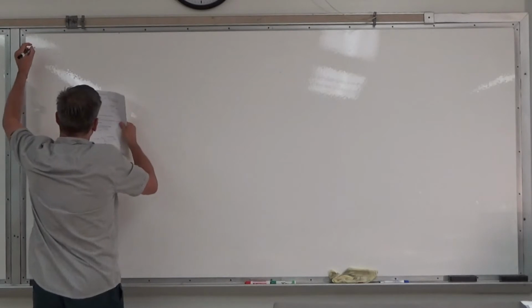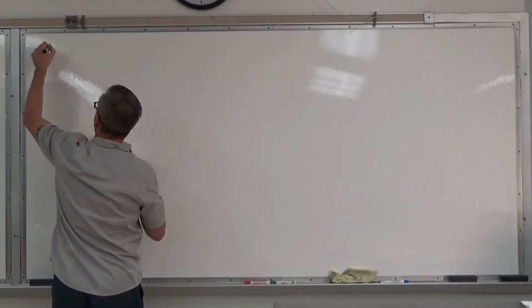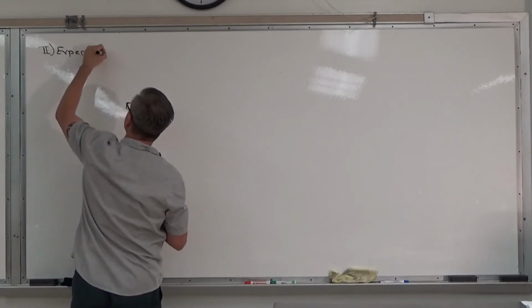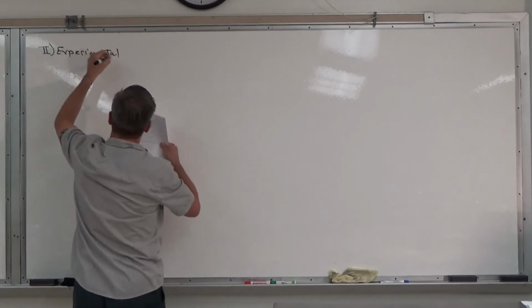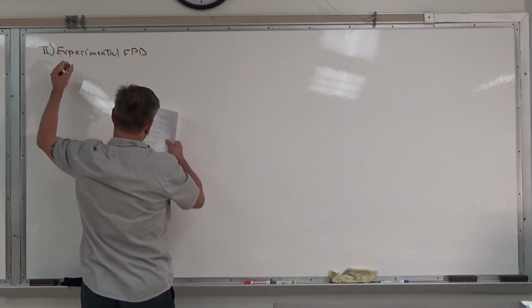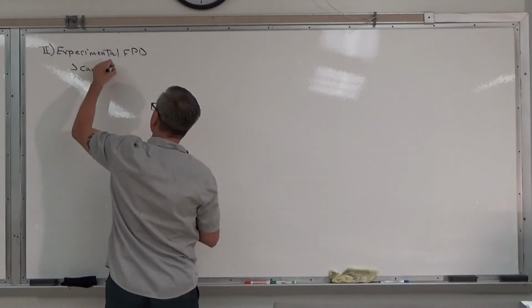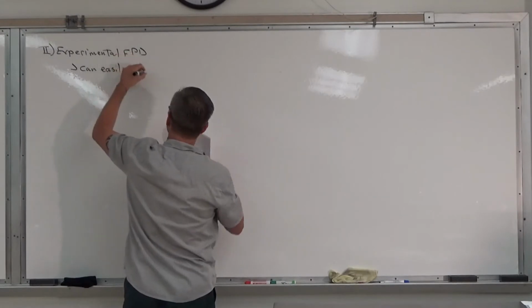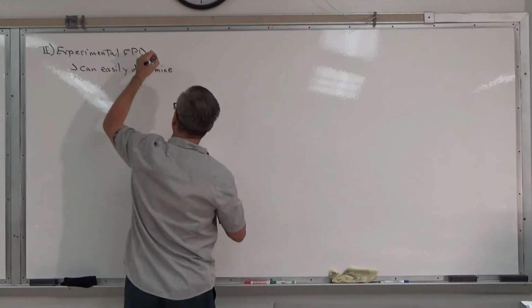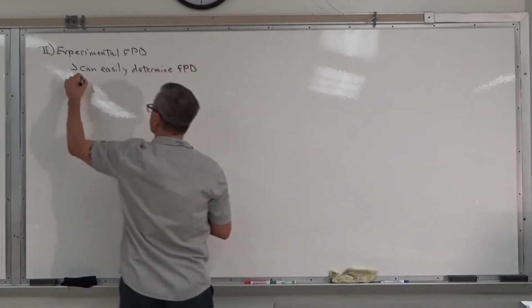Okay, so experimental freezing point depression. You can easily determine freezing point depression experimentally.